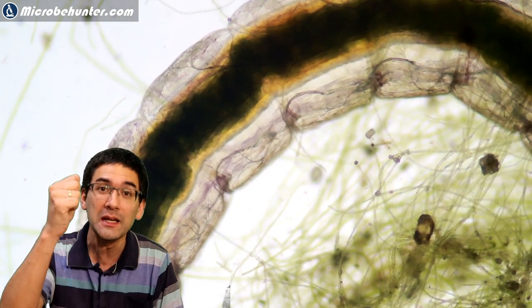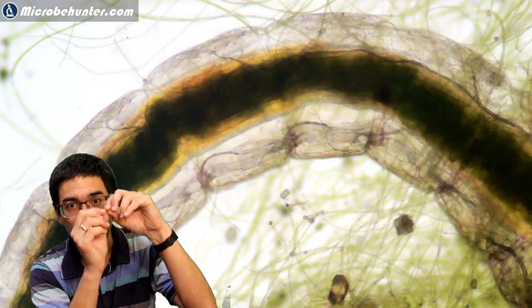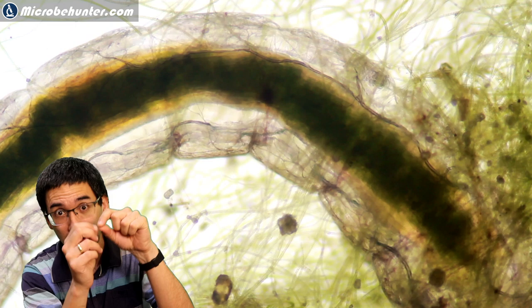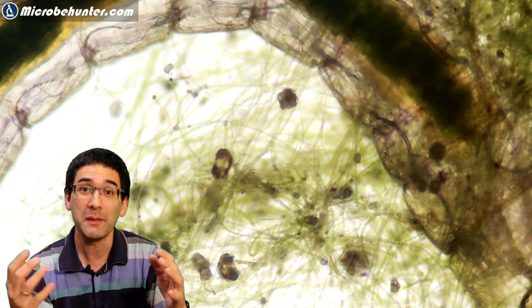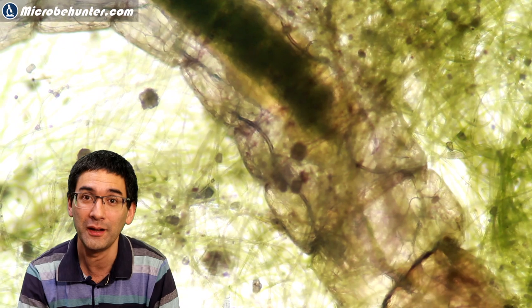They stick it up into the air, and the rest of the larva dangles downwards into the water. That's how they breathe as they swim around and feed until they reach a certain size.